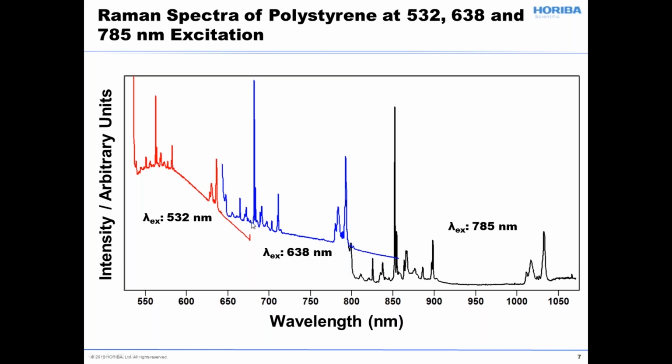Okay, that's good. We've reduced the photoluminescence. We haven't eliminated it, but we've reduced it. And finally, we go to an even longer excitation wavelength where we're no longer coupling into the absorption spectrum, the excitation manifold of whatever it is that's doing the absorbing and emitting. And so now we get a nice flat baseline spectrum at 785.